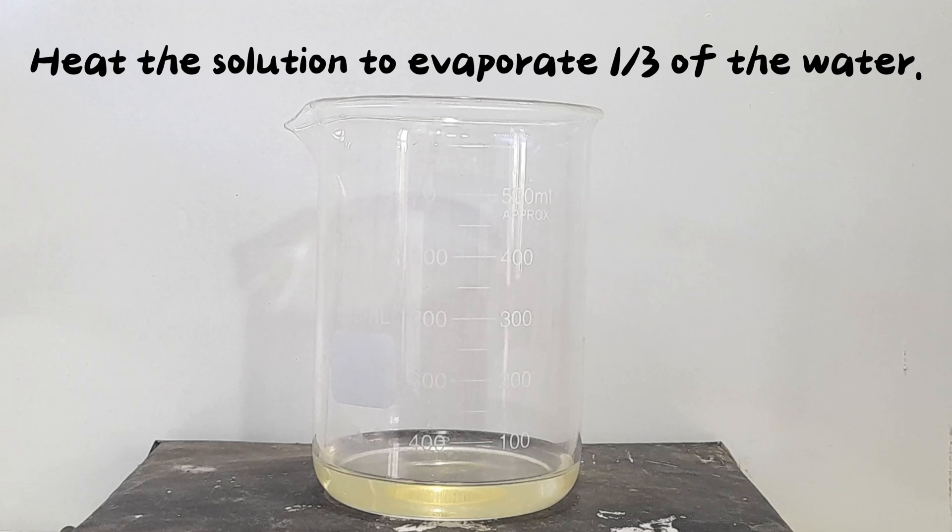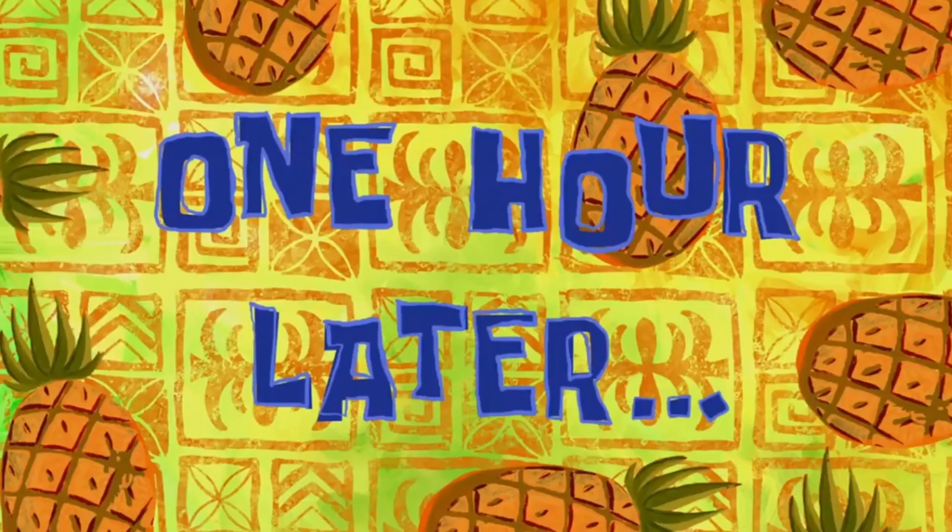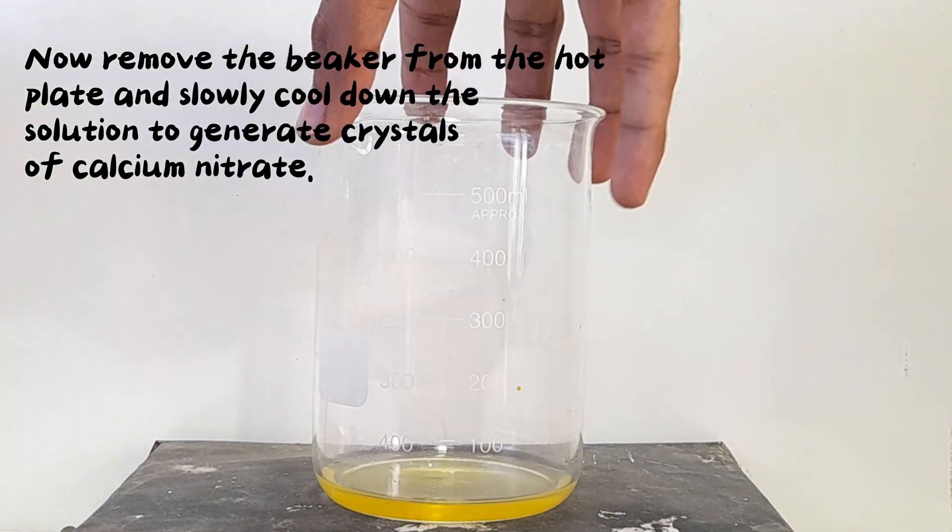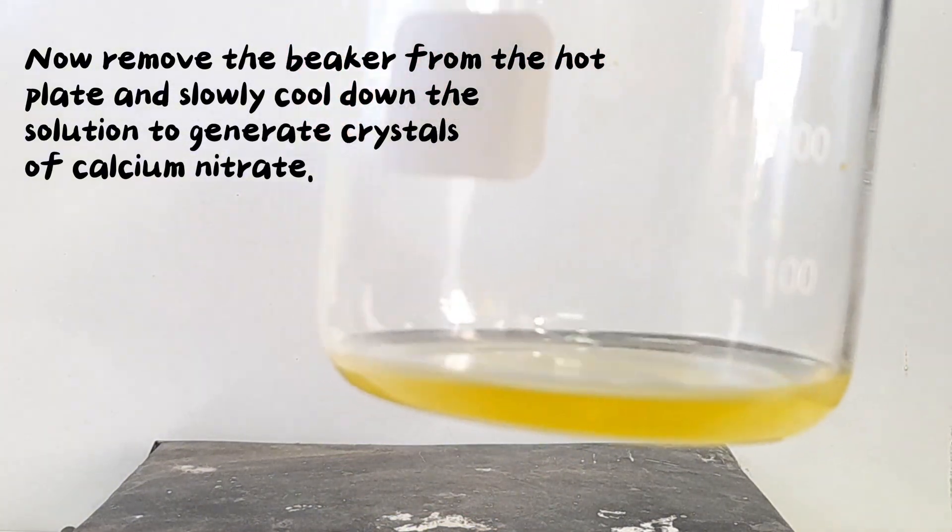Heat the solution to evaporate a third of the water. One hour later, now remove the beaker from the hot plate and slowly cool down the solution to generate crystals of calcium nitrate.